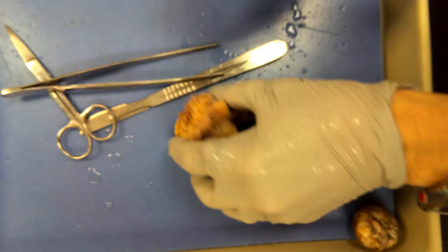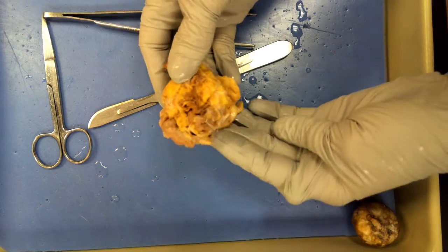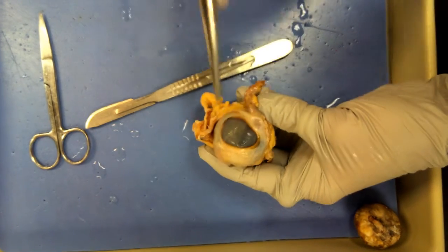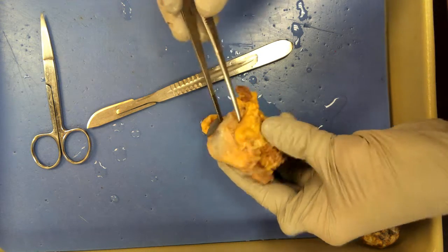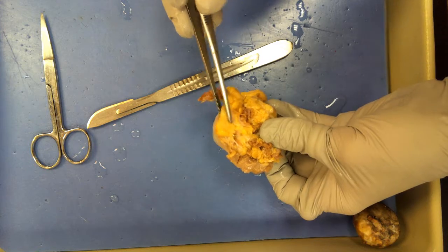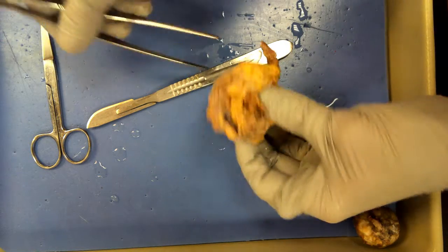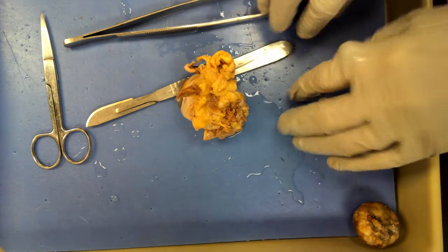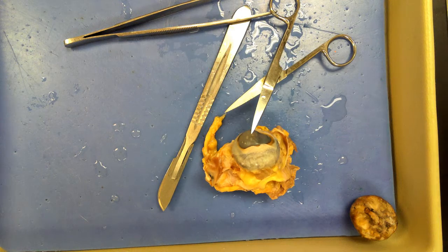I'm going to quickly go over the different parts of the sheep eye. As you can see, it looks like a meatball. There is the cornea — that dark part right there is the cornea. The white part is the sclera. The yellowy substance is adipose tissue, whereas the pinkish substance are the extrinsic eye muscles.